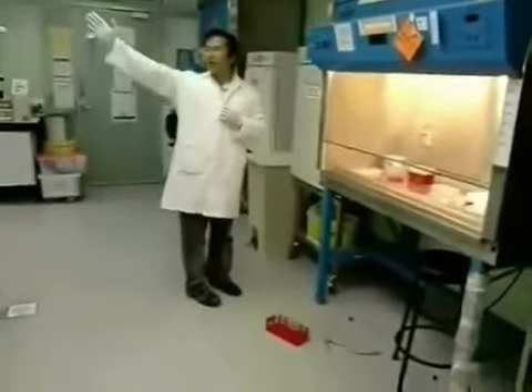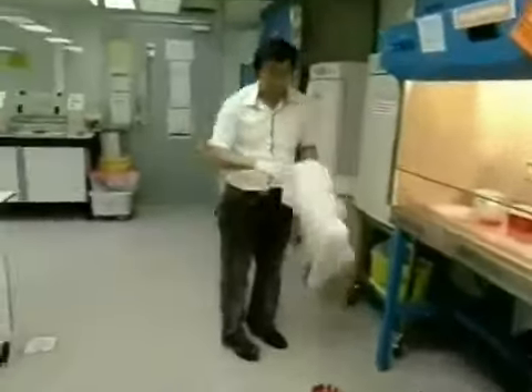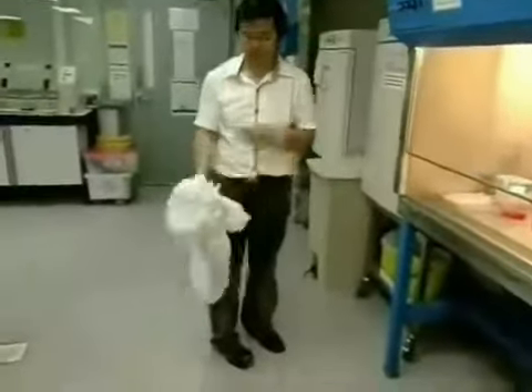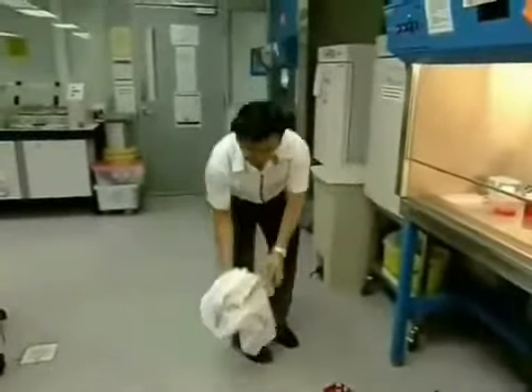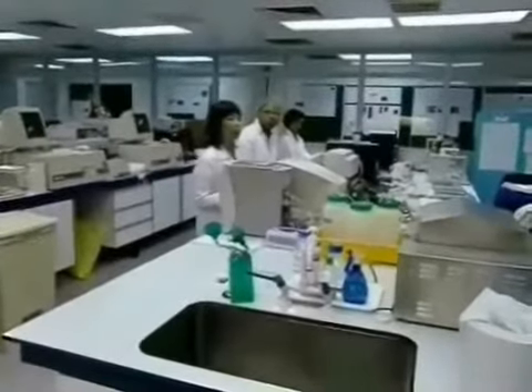Michael, you scratched your head with contaminated gloves. Hey, don't throw the PPE on the floor. Don't you think that she should tie up her hair?